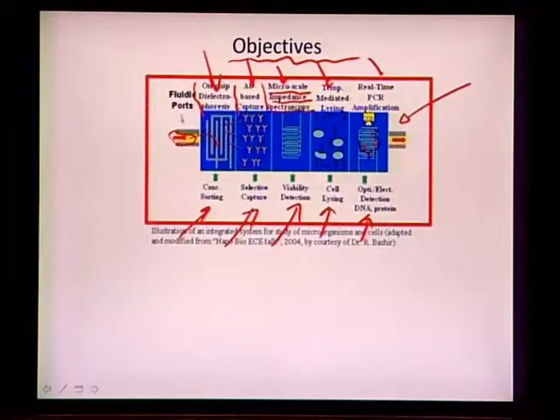So, that is one step within this biochip. The fourth step here is really a temperature mediated lysing, where cells which are actually now grown on the chip are lysed open, and the bacteria and the DNA kind of goes out in the atmosphere, and then you use a real time PCR amplification platform which is on the same chip itself to identify based on optical means, or as we have planned for later purposes, electrical means of detection of DNA.